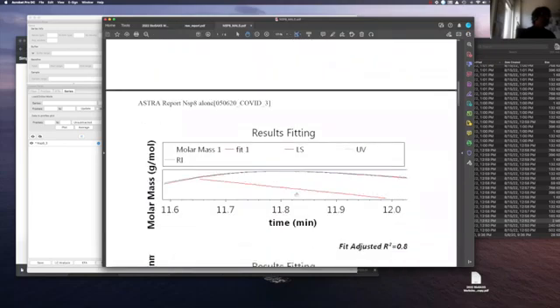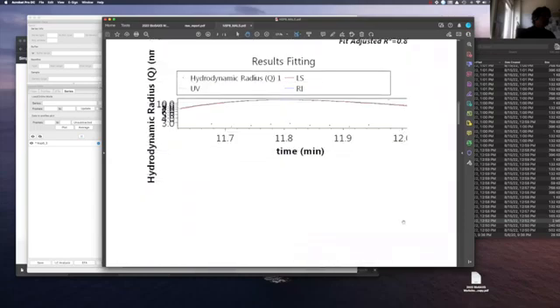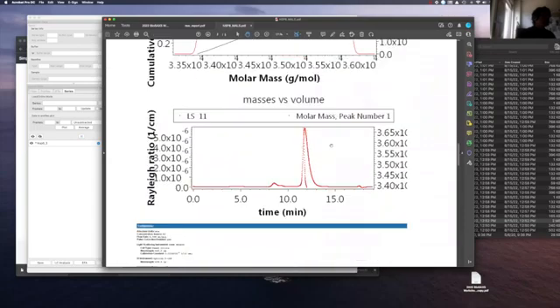And then you get information about the molecular weights. It's not so well seen here, but you can see it better here. The molecular weight is a little bit truncated here, but you get an idea across the maximum of the peak. The molecular weight is 36 kilodaltons, and it drops to 34 at the peak. That's unusual. That kind of surprises me because this NSP8 is supposed to be 22 kilodaltons. So already I'm expecting some strange stuff going on.